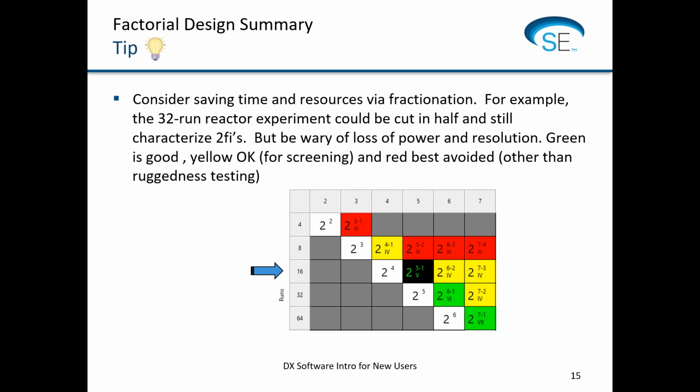Excuse me, 77% power. Well, that's probably close enough to 80 that I would be highly tempted to go run it. I do want to get to 80 usually, but you know, if I could cut the work in half, that might be sufficient to find what I'm looking for. Okay, so I might take a risk and go ahead and do that.